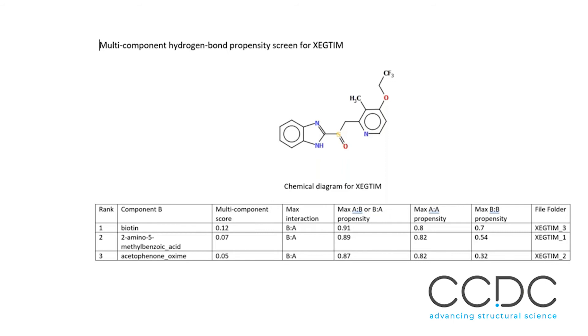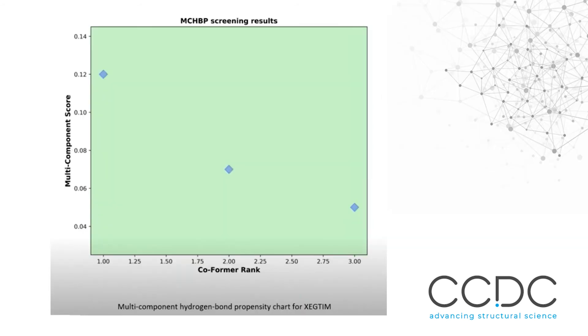You can see all the scores nicely here, and you get a picture. Of course, everything that's above zero will be in a green region. In this case, because I only ran three conformers, you only see three points and they're all in the green area.